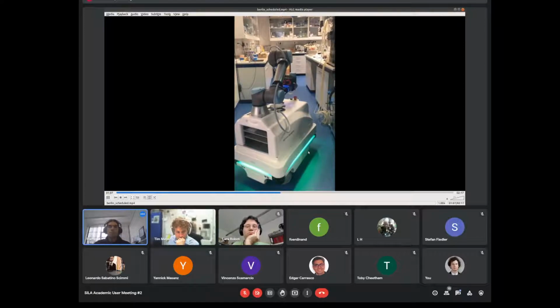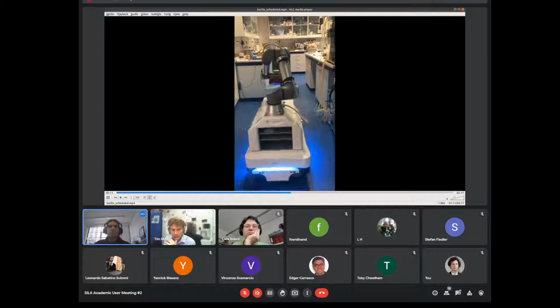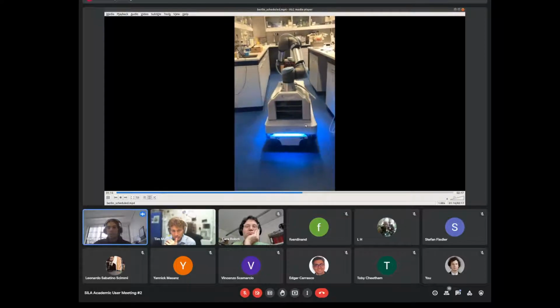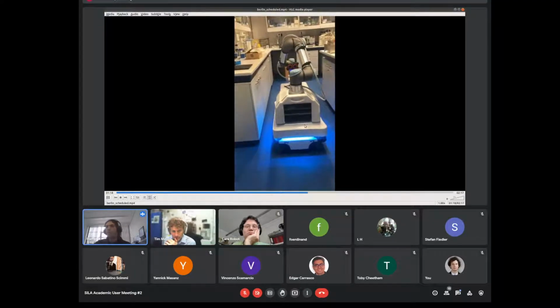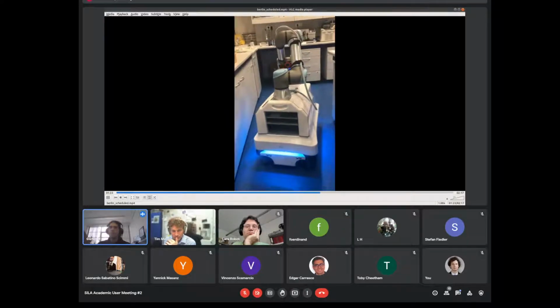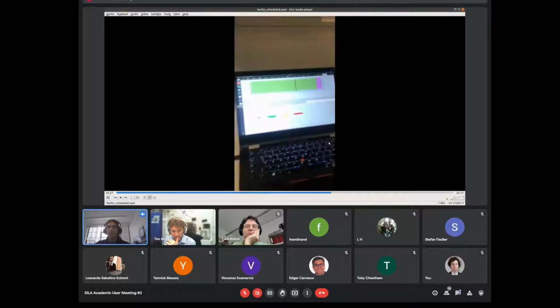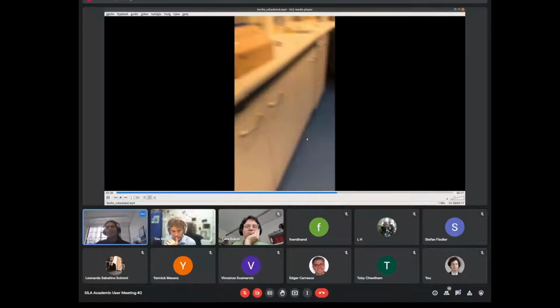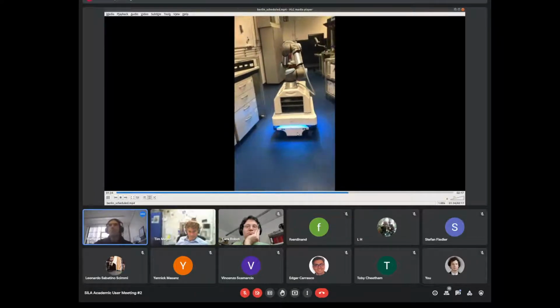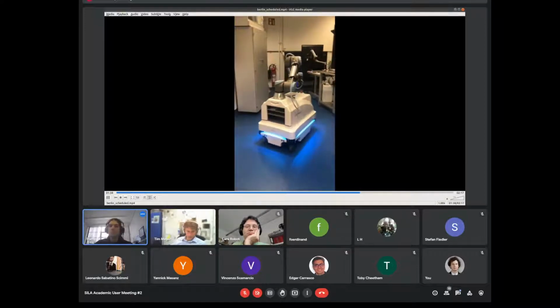And yeah, now it will go through this corridor. It has to be taught very carefully. So as Adam said, right now the status is that you have to teach every position by hand and model, yeah, that's my laptop, and model the environment so it doesn't get lost. So it's driving quite slowly to avoid these errors.